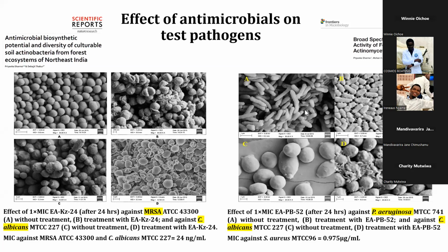And this is again Pseudomonas aeruginosa, and this is Candida albicans. So these are the control cells, that is, without any antimicrobials. And this is after incubating with the antimicrobial for 24 hours. You can see that there is a change in the cell morphology, and also you can see that here there is cell breakage. So this confirms that the extract has antimicrobial activity.